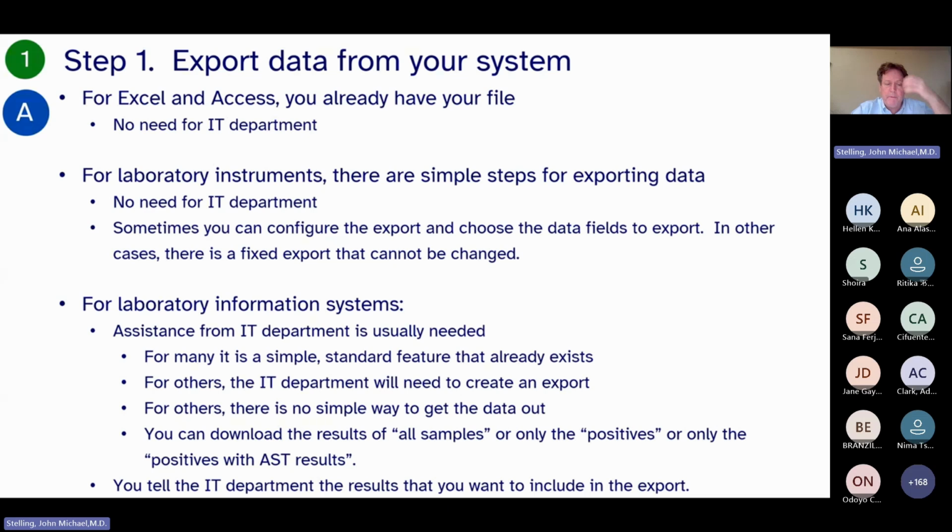We do have explicit guidance on how to export data from Meditech, Cerner, Sunquest, SILAB. We can do it for SEDRI-LIMS. We have not yet made documentation for it, but we're in the process of collaborating with the developers to make documentation. So for many LISs, common LISs, especially the free ones, we can tell you what the steps are to export. And other ones, if it's an LIS that you made locally, we can give you guidance, and we have a document on how to do that.